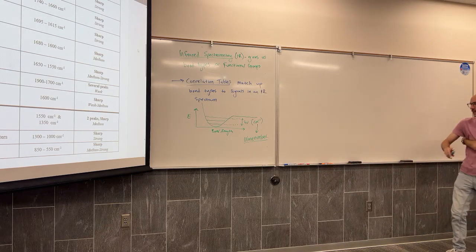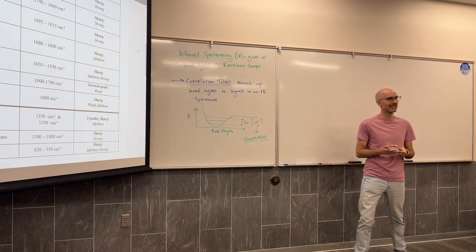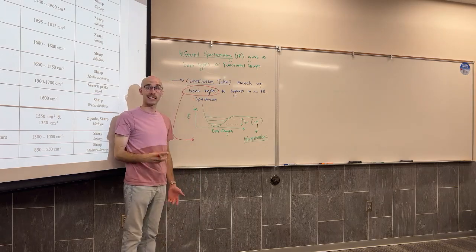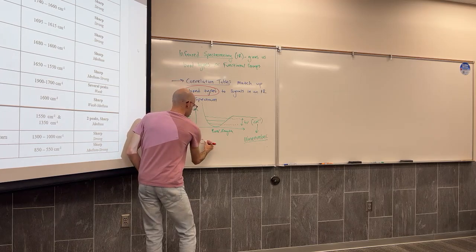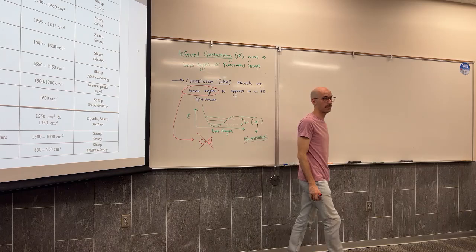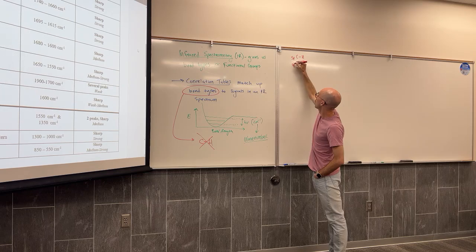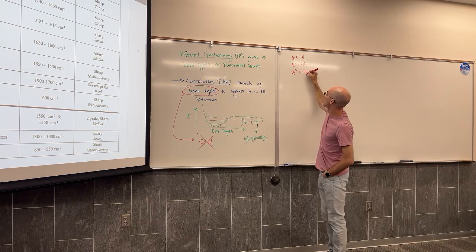One more thing I want to say about bond types. We're not just analyzing the atom on either side of the bond, but we are analyzing, in some cases, the hybridization. CH is not a meaningful bond type to us. We need to distinguish an sp2 CH from an sp CH from an sp3 CH.